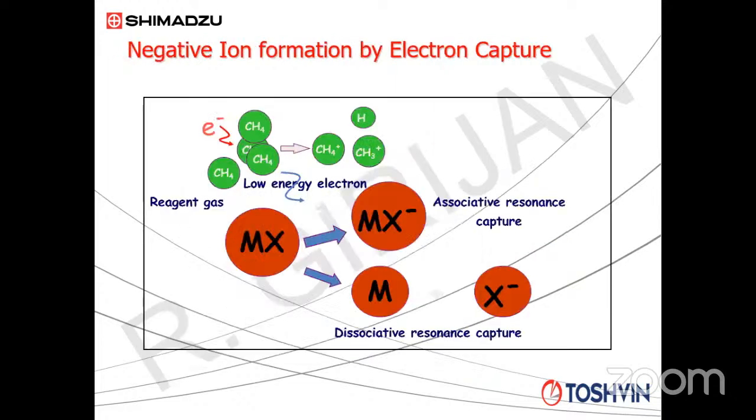electron impact ionization. Coming to negative ion, NCI, negative chemical ionization is basically for electrophilic compounds which have an affinity for electrons, can attract electrons and form a negative ion. So when you select the NCI mode in the software, the lens polarities will be automatically adjusted, and it will collect only the negative ions and the positive ions will be discarded.